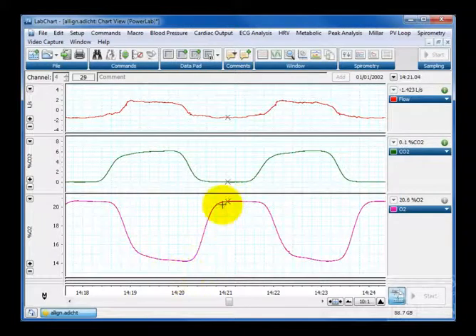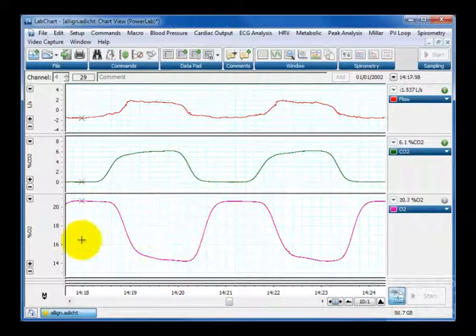So what we're going to do is shift the O2 channel to the left so it lines up nicely with the CO2 channel, so that any measurements you're taking you can align temporally rather than just having them as a reading on the screen.